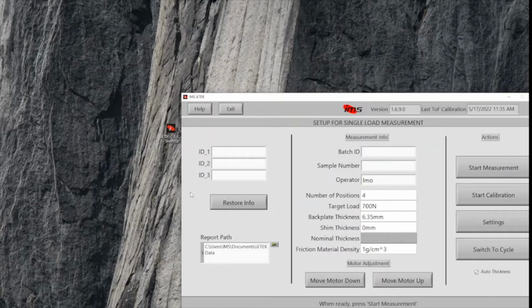All of the data on modulus comes out in megapascals per gram per cc. So if you want to recover the true modulus, you have to multiply by the density. The measurement process is initiated simply by clicking the Start Measurement button. So we'll turn this on and we'll show you the interaction.